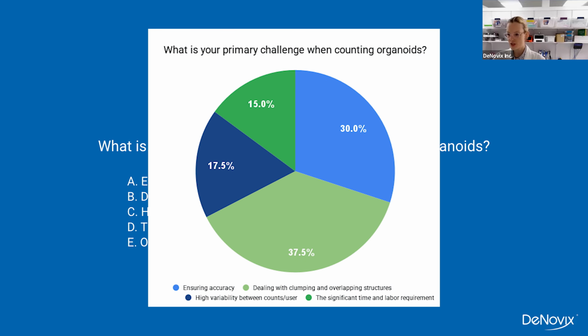All right, so the device that I will be demoing and discussing with you today is our CellDrop FLI. So some key features to get us started. We are able to count cells without slides or consumables thanks to our direct pipette technology, allowing you to save time and money there. Of course, in addition to bright field, we have dual fluorescence.